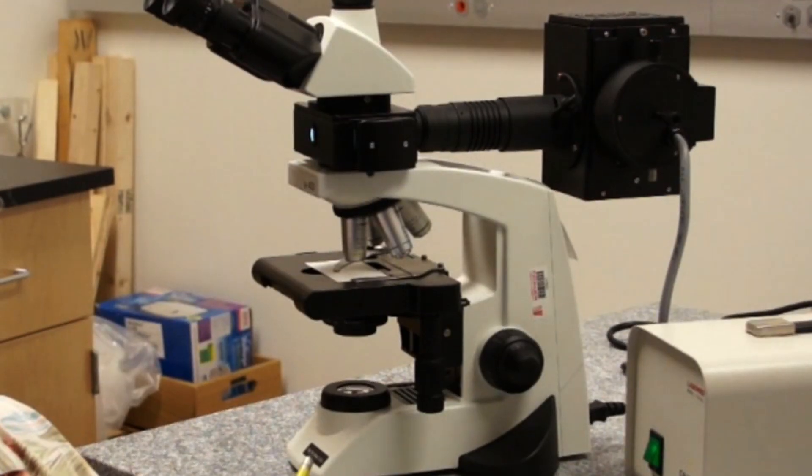We are going to begin our discussion of microscopical principles by using a standard compound microscope. Now you're probably familiar with dissecting microscopes, which you've used in some of your labs to dissect organisms or other things. That's a very low-power magnification instrument.